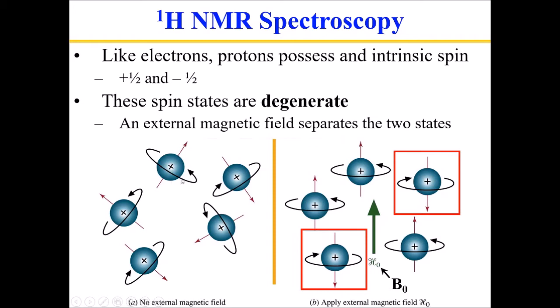That proton actually has an inherent spin, and the spin of the proton generates a magnetic field. Those magnetic fields are very weak, but if you put them in a very strong external magnetic field, essentially sandwiching the sample between a very powerful electromagnet, it will force those hydrogen nuclei inside of water or your hydrocarbons to line up so that their magnetic field, denoted by this red arrow, is going the same direction as the external magnetic field, denoted by this green arrow.